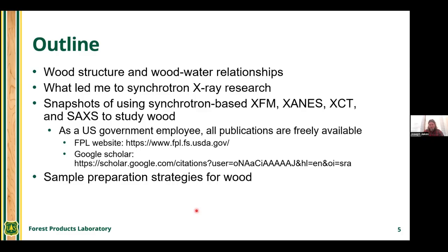And then the majority of my talk today, we'll talk about different sample preparation strategies that we developed for studying wood at synchrotrons.